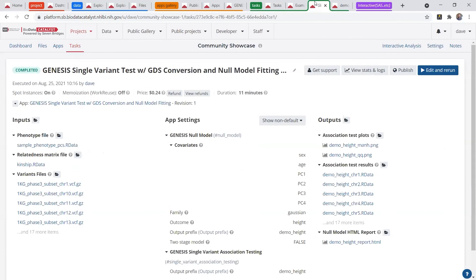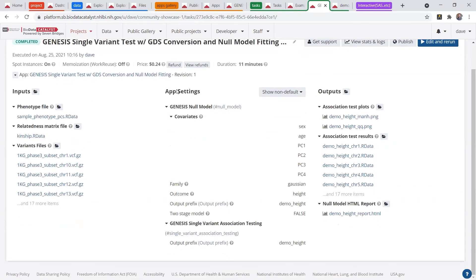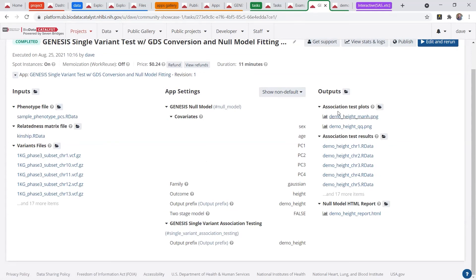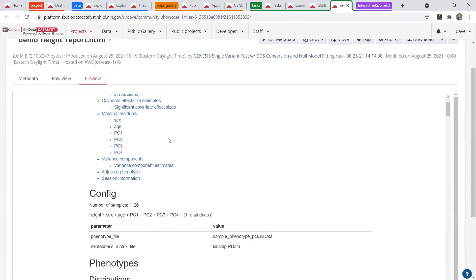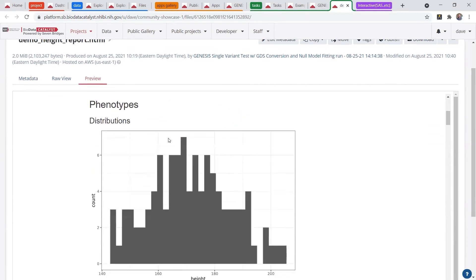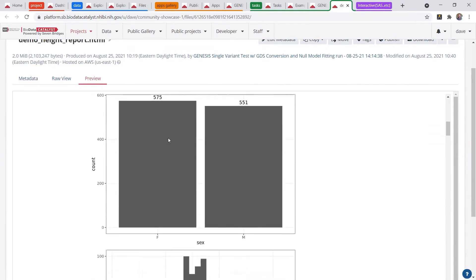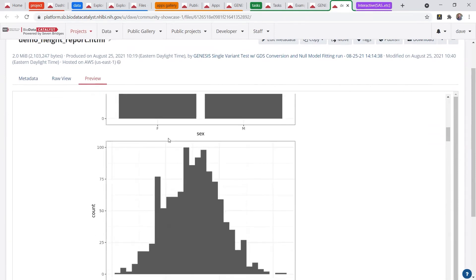When your analysis is completed, you'll be able to see those file inputs, the app settings, as well as the outputs, many of which you can view just by opening up right on the platform. In particular, HTML files and images display really nicely, so you don't have to download them.